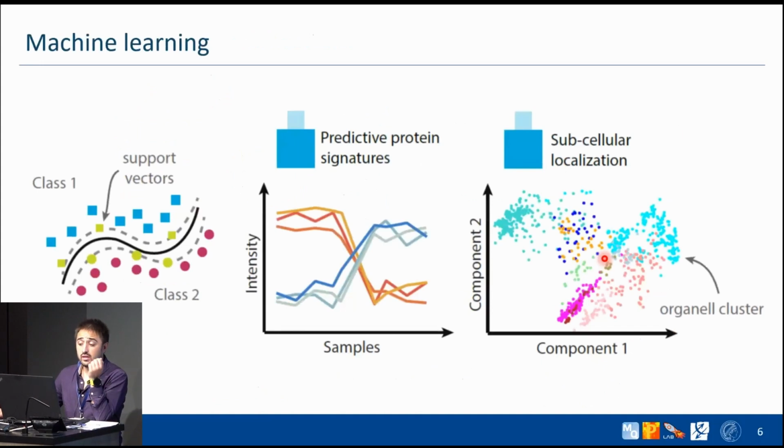Yes, so as I said at the beginning, we also provide a learning module. In machine learning, what you want to do is learn from the data you have and create a rule that will generalize better for unseen examples. In this example, let's say the blue and the pink or purple points will be two different classes, so this will be healthy and this will be sick.